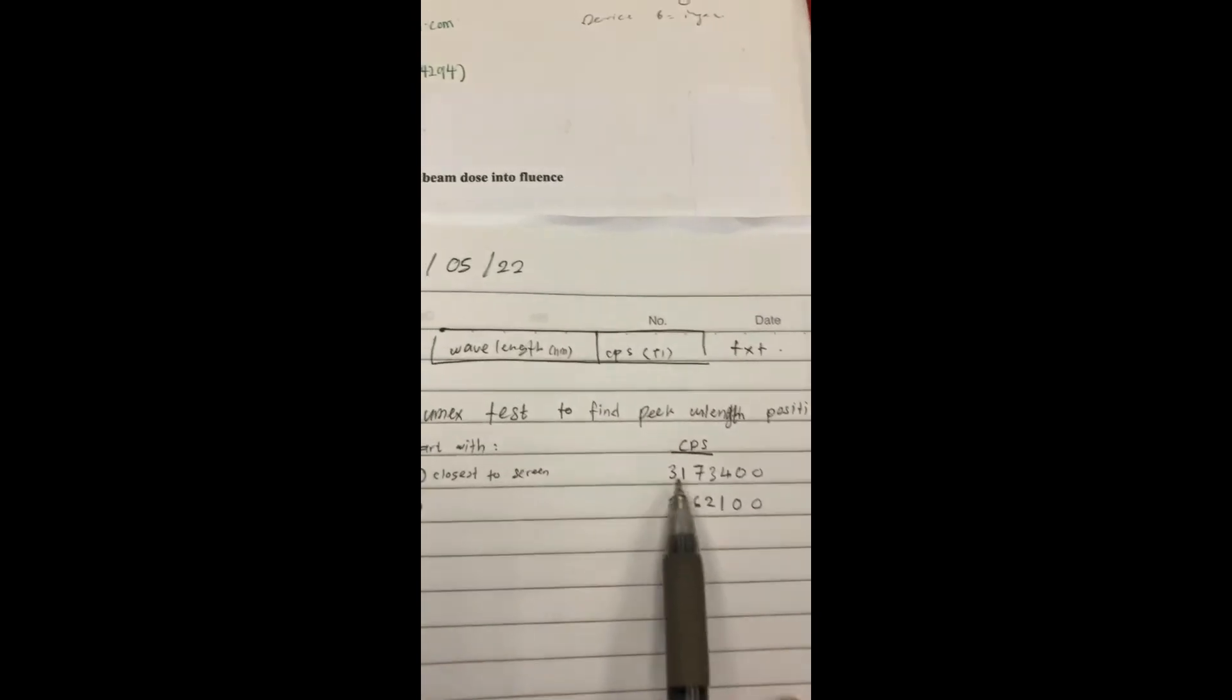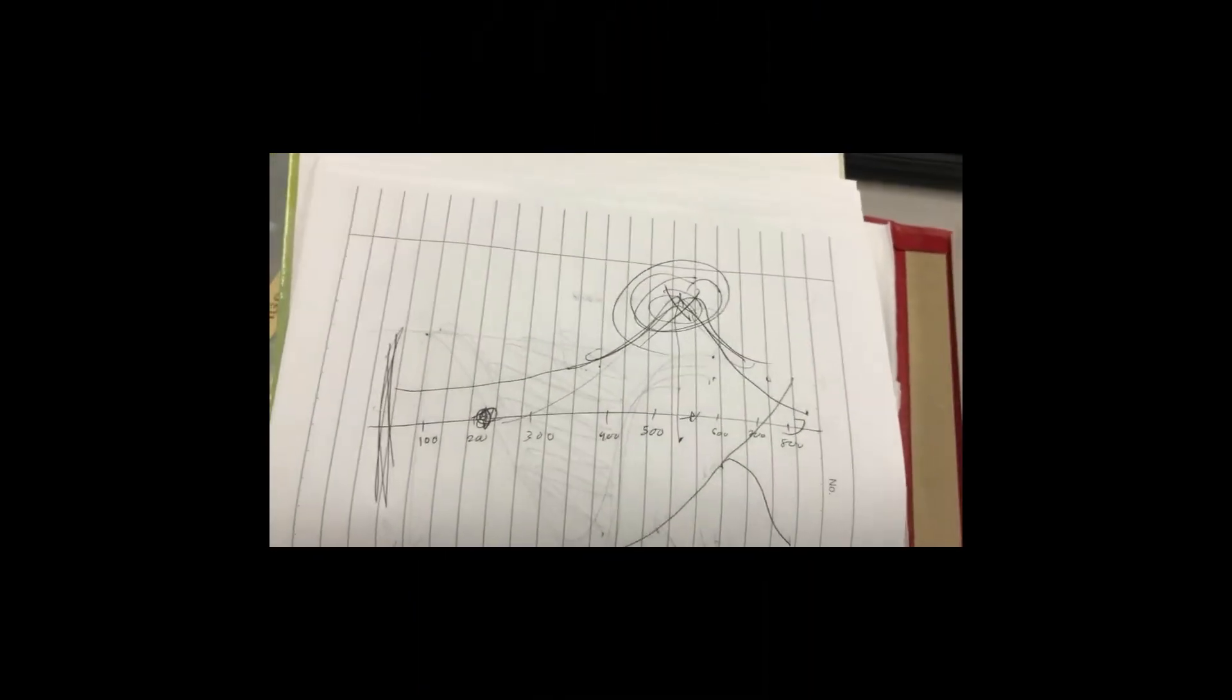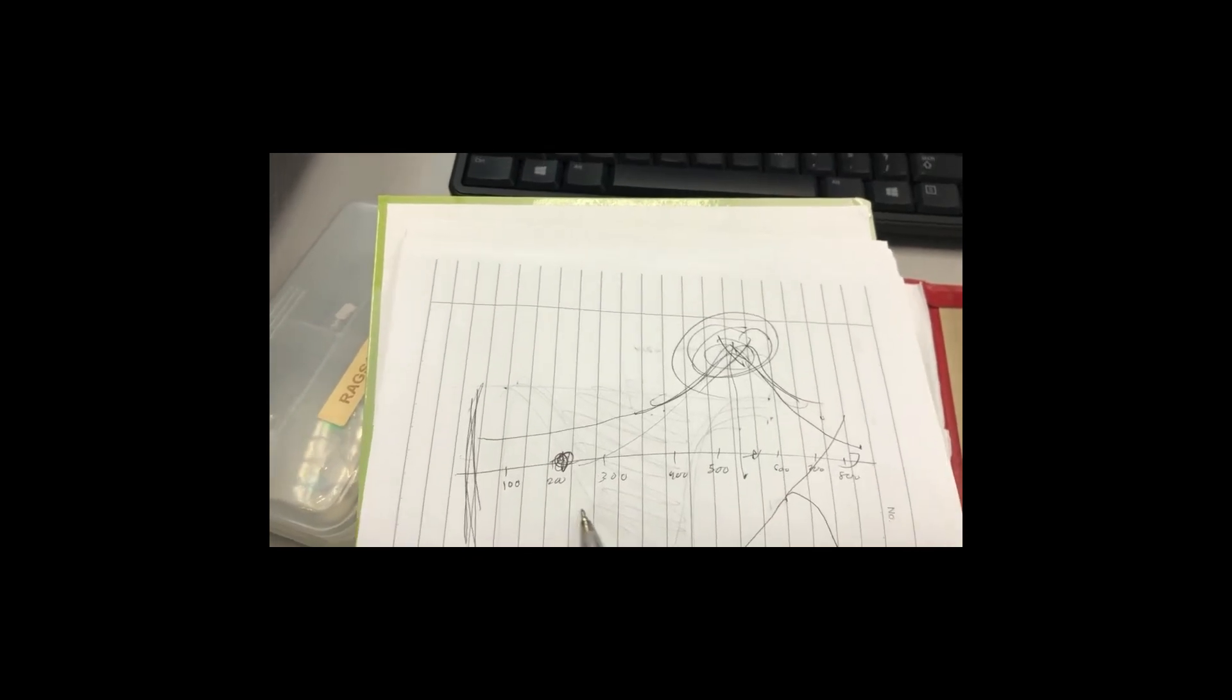Why does the value increase? This is why. As you can see here, just now we tested with the Horiba with the full range from 200 to 800, right? So the graph will look like this.